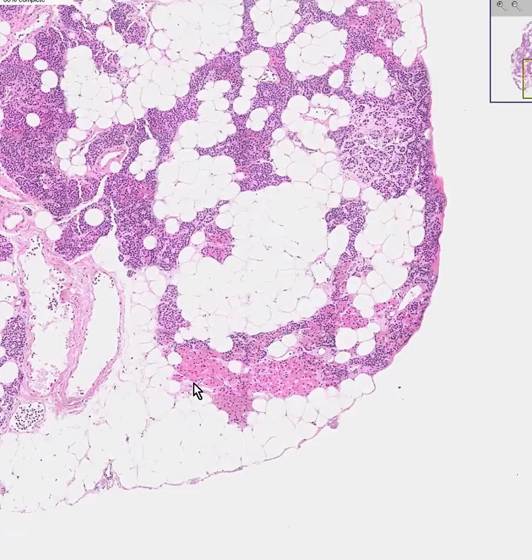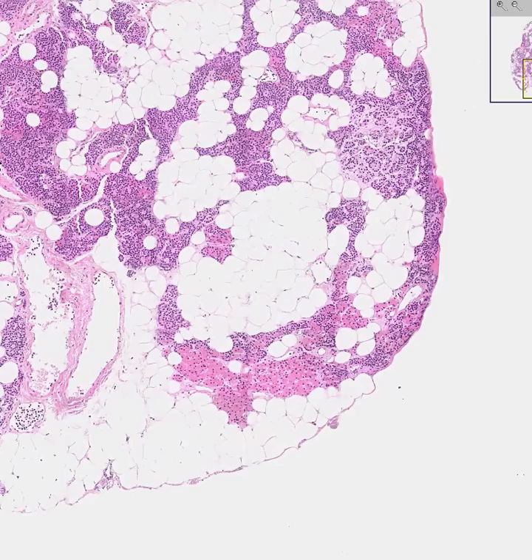The second most common type of cell, which is considerably less than the chief cells, are these red cells. They are called oxyphil cells. The chief cells and the oxyphil cells are the active cells of the parathyroid, and I believe that the chief cells are even more active, but don't bet your life on it.